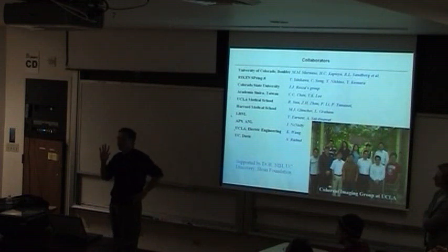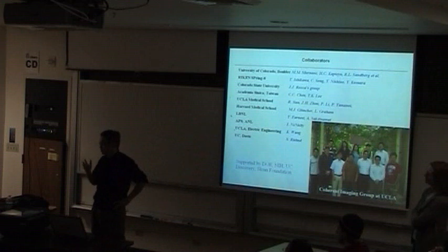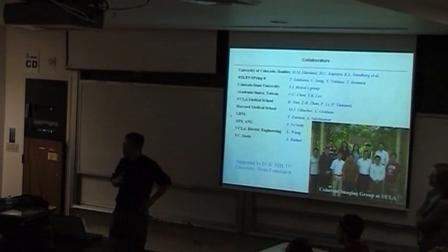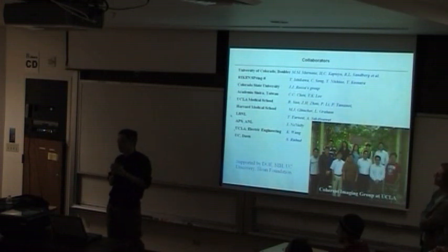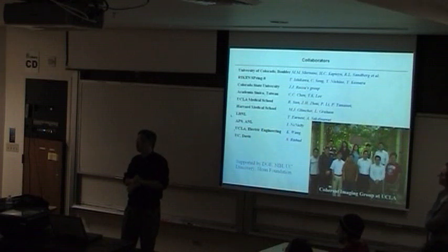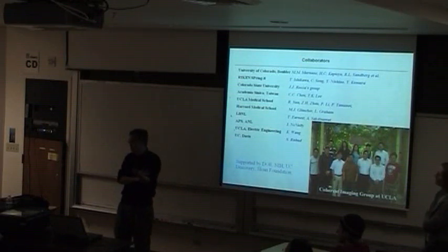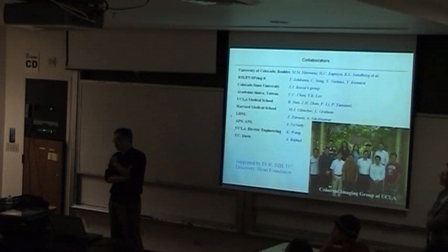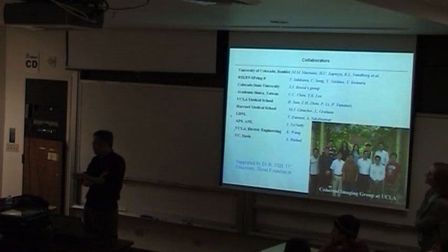We have no problem so far. Probably maybe 30 groups worldwide are working in this area. The reconstruction problem is more or less already in the pocket, I would say. Now it's about getting a quality diffraction pattern. With noise, of course, it depends on how much noise. If the noise dominates the signal, then of course you cannot expect much. But with a reasonable signal-to-noise ratio, even with very weak signals, you can reconstruct it.